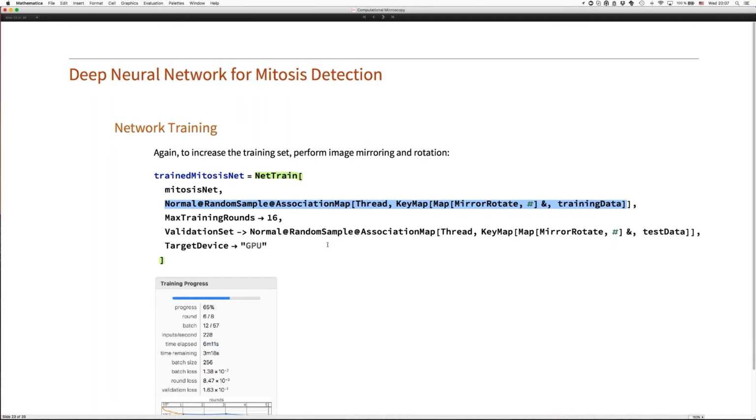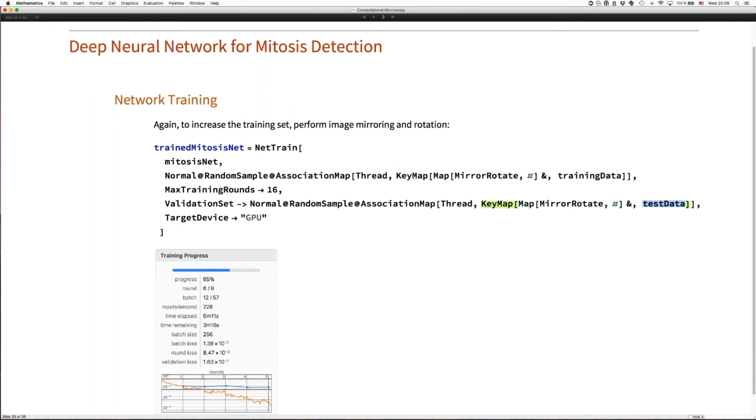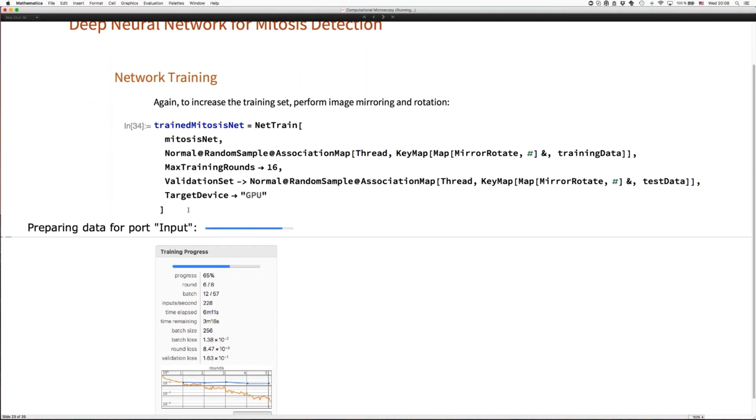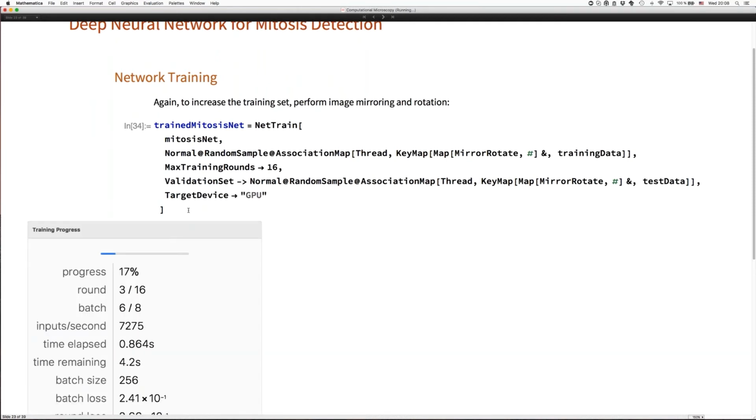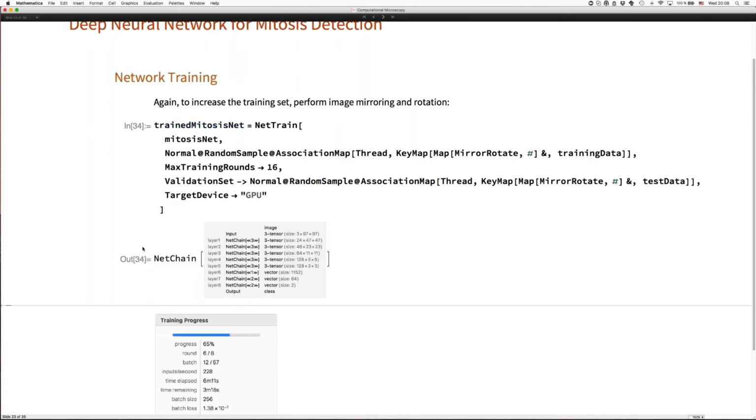So I just want to make sure that I learn with my network the essential properties that allows me to predict. And then I predict not on the data set that I have learned, but I predict on a data set that I have set aside, the test data set, to see if what I have been learning actually amounts to something. And then what I can do is here just run this, and this will fire up the neural network that I run here on a GPU. In this case, it goes very quickly. It takes less than 10 seconds.